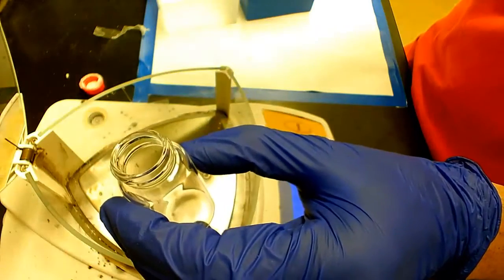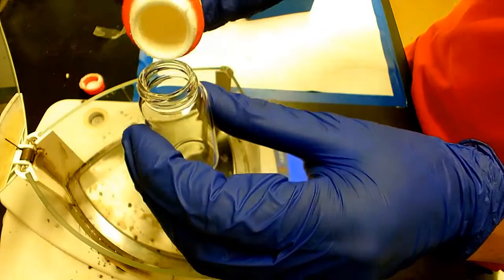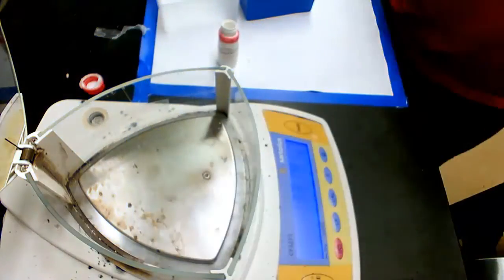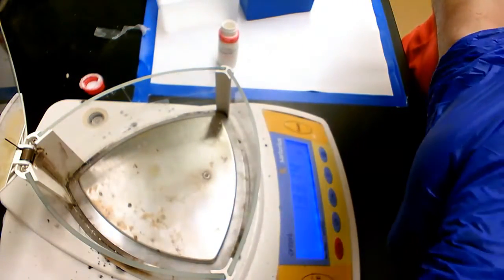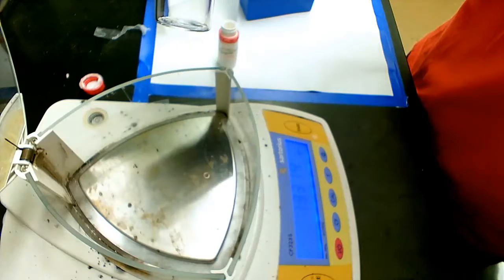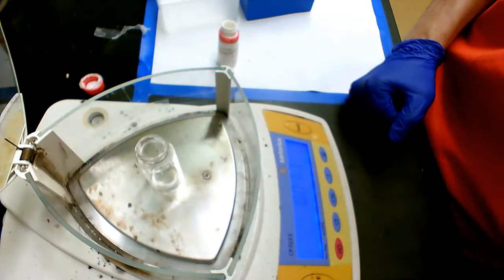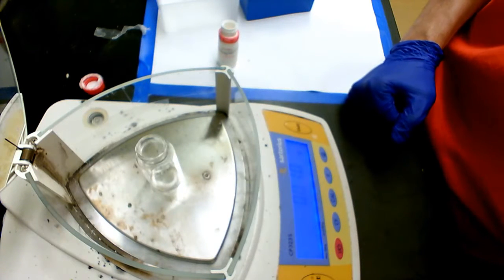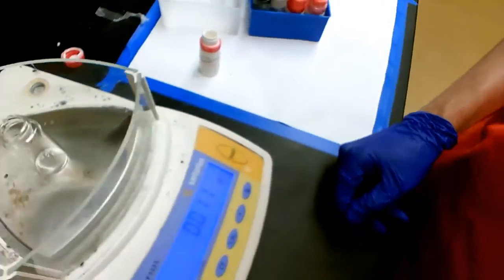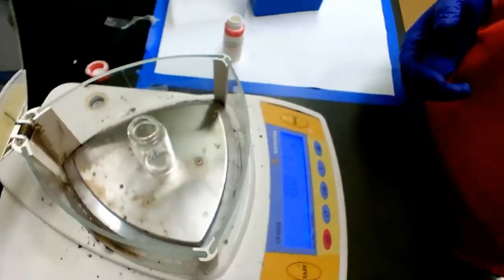So I'm going to hold my vial like that, and then carefully drop this polymer into this vial. We want to avoid using a spatula or something else to get the polymer, because that might cause some contamination. The preferred way to get polymer out is just by tapping the polymer into your vial. As you can see, I just got 0.011 gram, and just for this demonstration, this is sufficient to show.